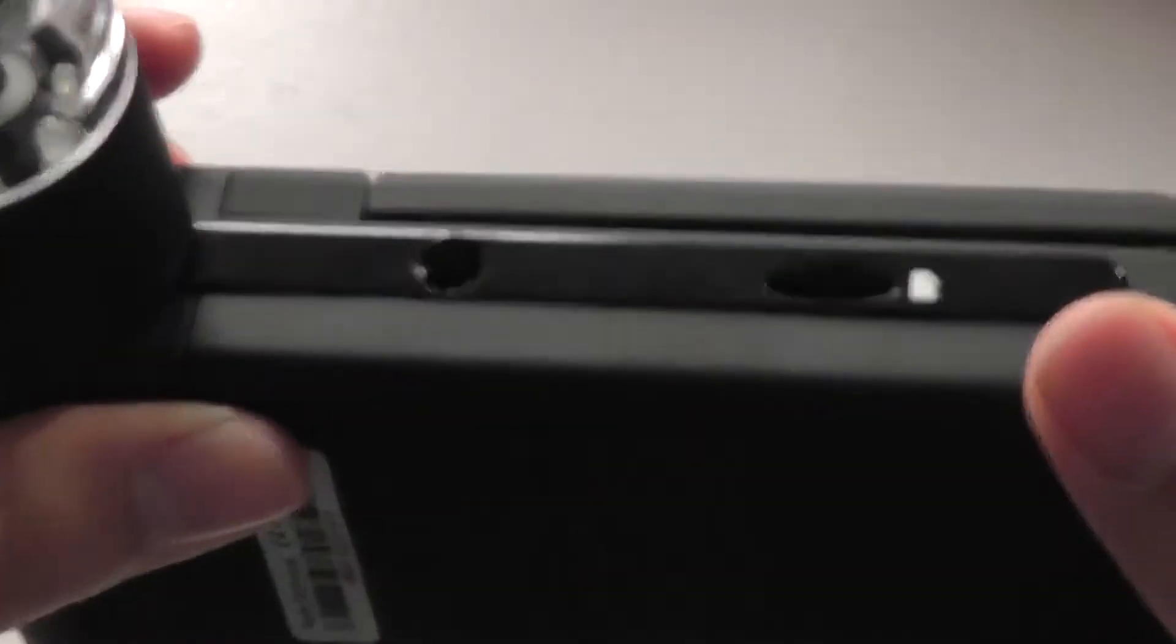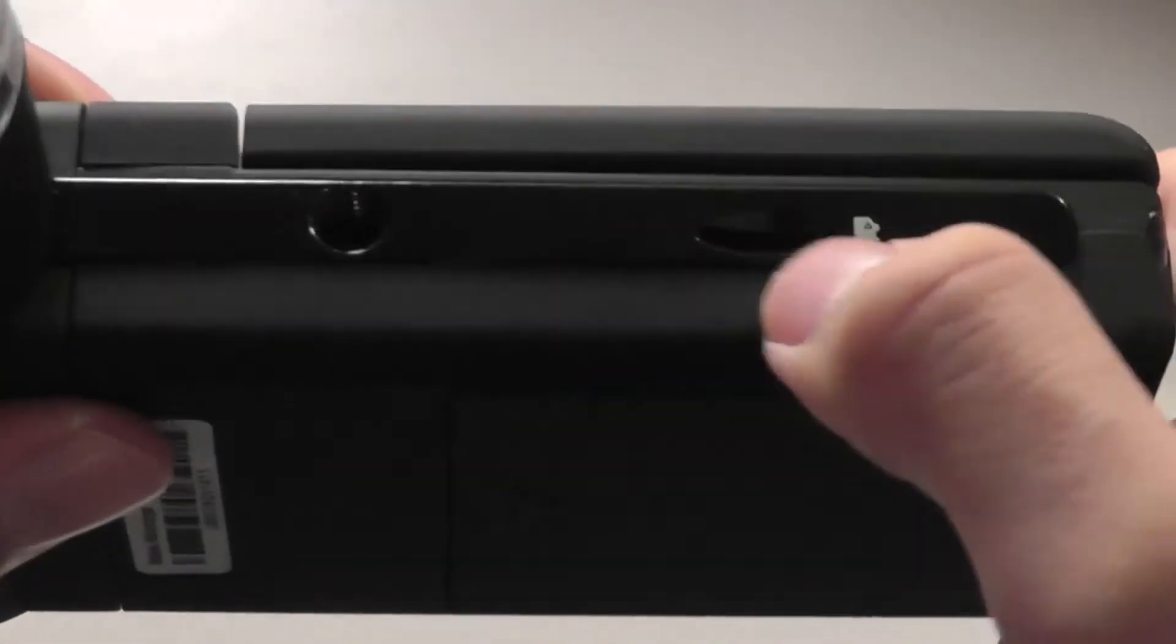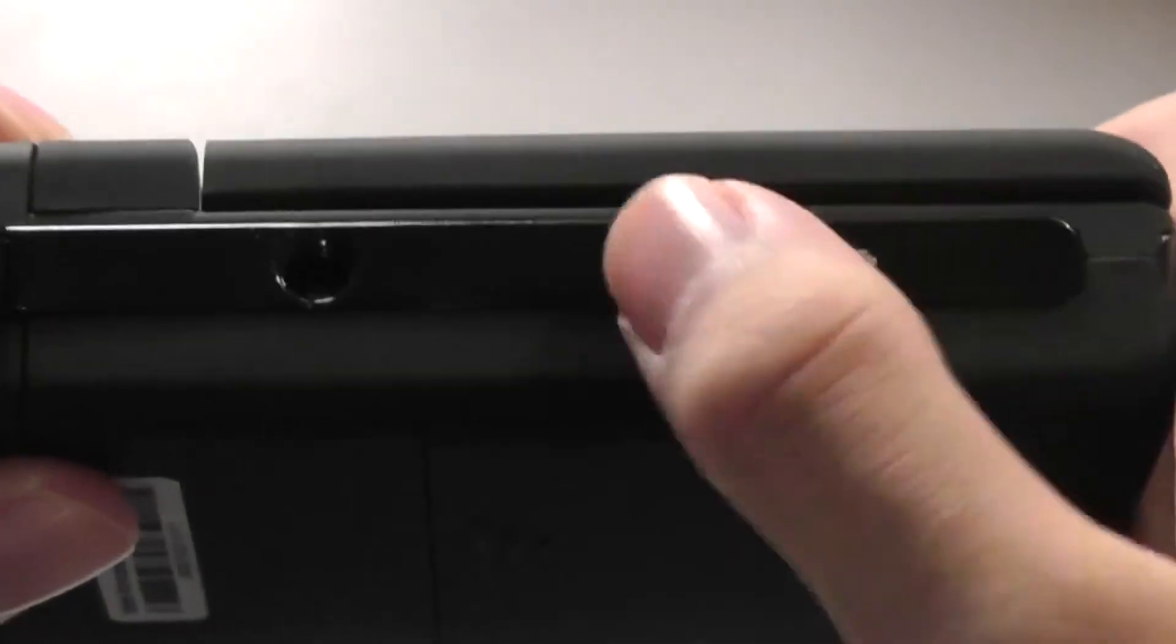On the sides here, you have access to a tripod stand for mounting it. There's also the full size micro SD card slot for you to swap out media. You do need one to get the device started up and to use it.